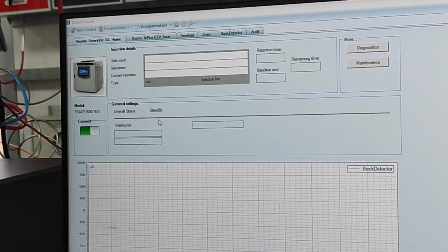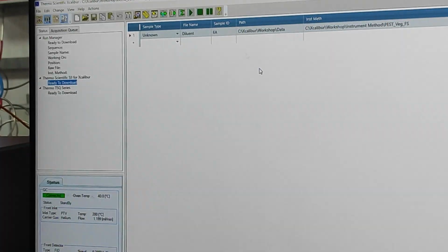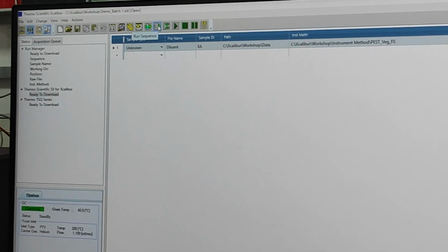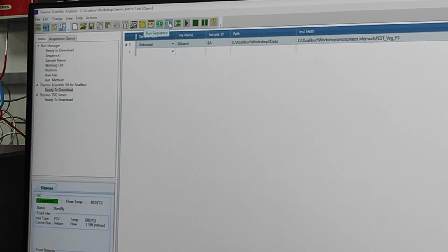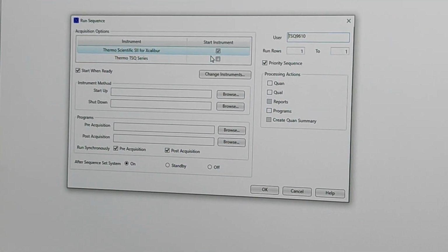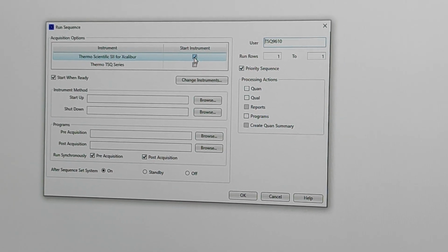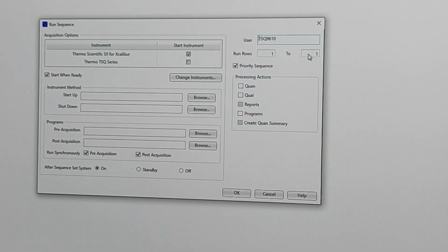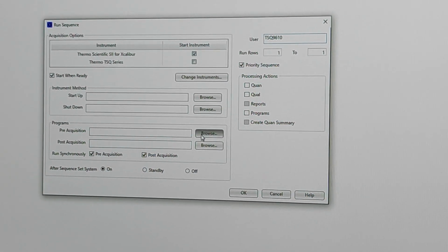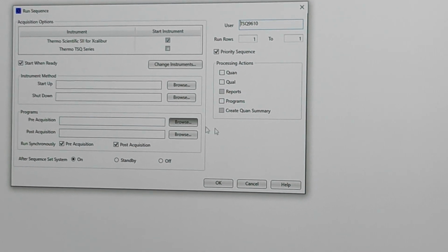Now it is controlled, all parameters standby. This is also okay, and MS is also fine. I'll select it. I'll acquire run sample or run batch. If you have multiple samples, you can go with run sequence. Otherwise, run sample. It will ask while running which instrument should start first. See, Thermo Xcalibur, right? So GC is going to start first, and I'm injecting the row, only one we have here. If you have any standby method or shutdown method, you can select it and submit. After the sequence is completed, it will automatically go to the standby or shutdown method.